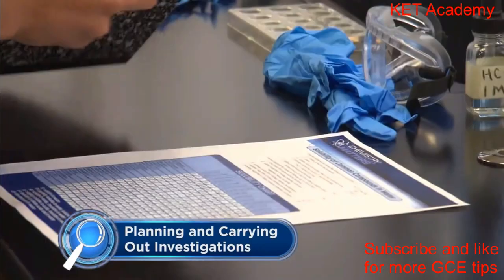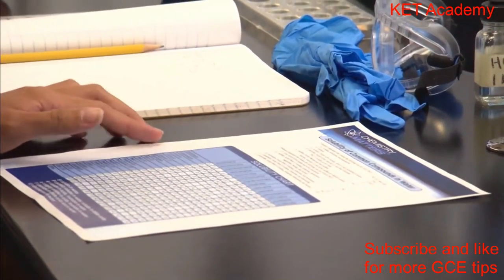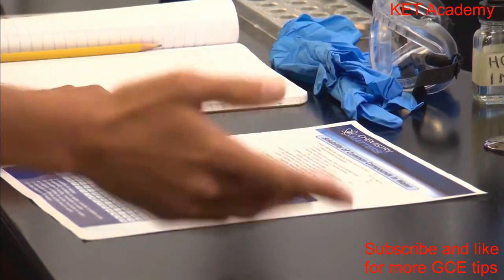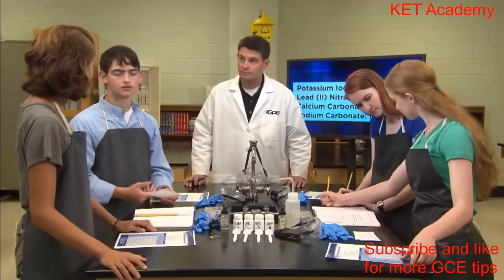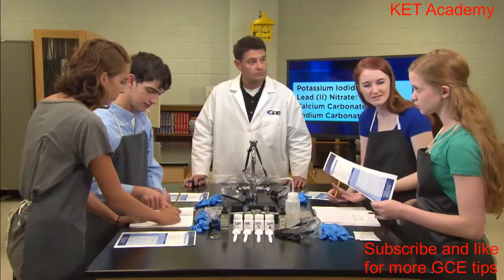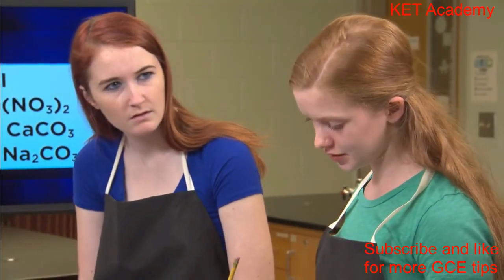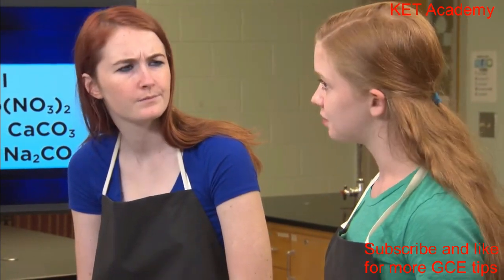All right, the first test is a solubility test, so we'll need the solubility table. Okay, let's look up the solubility of the unknowns. Calcium carbonate is the only insoluble unknown. The next test uses sodium chloride to identify lead. How does it do that? Looking at the solubility table, lead chloride is insoluble. But other chloride compounds, like the sodium chloride we have, are soluble.